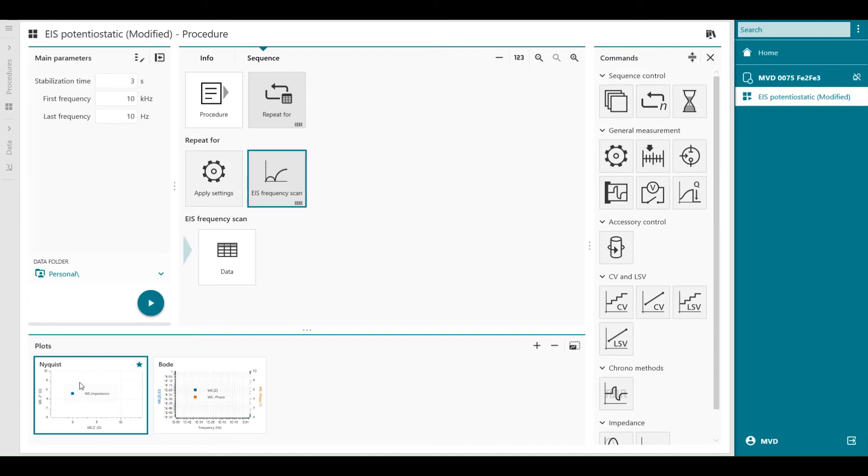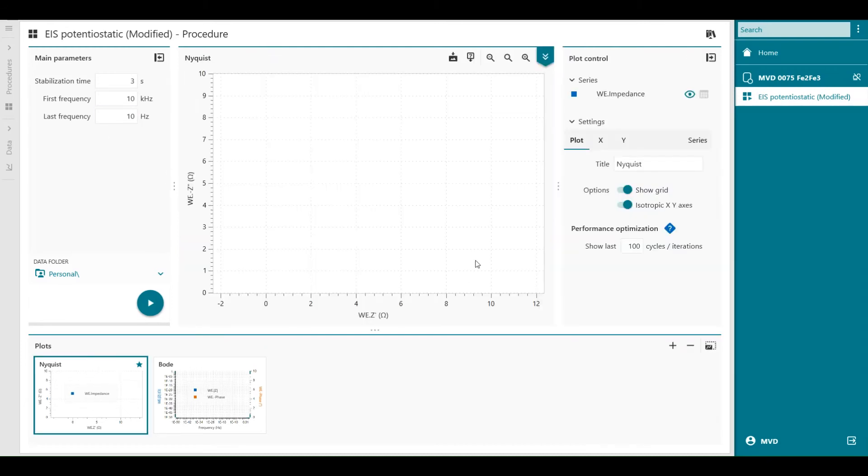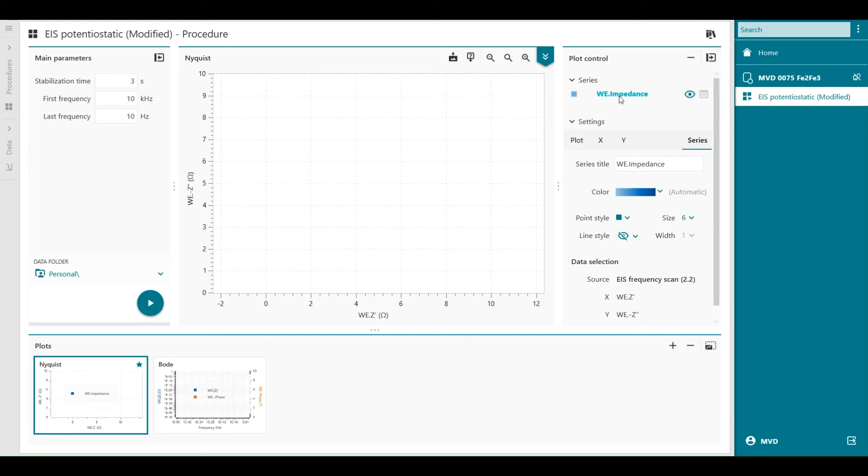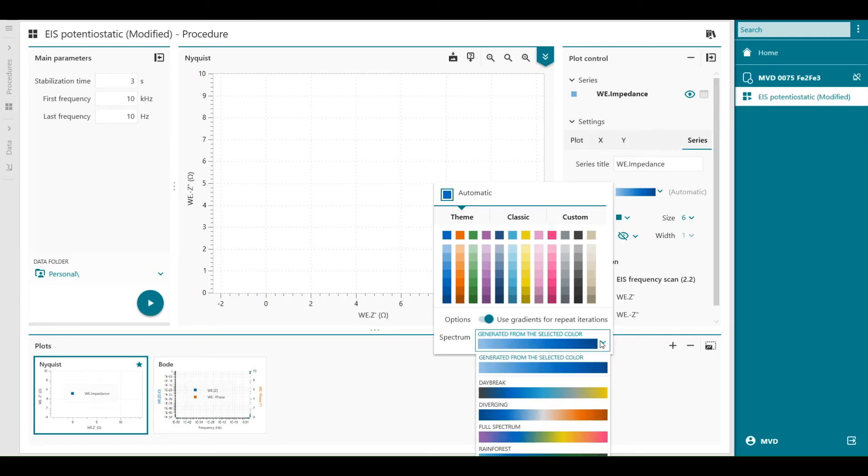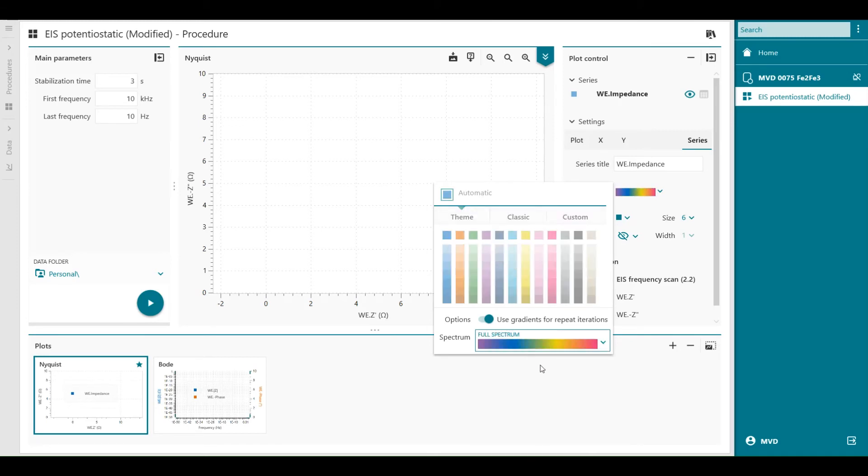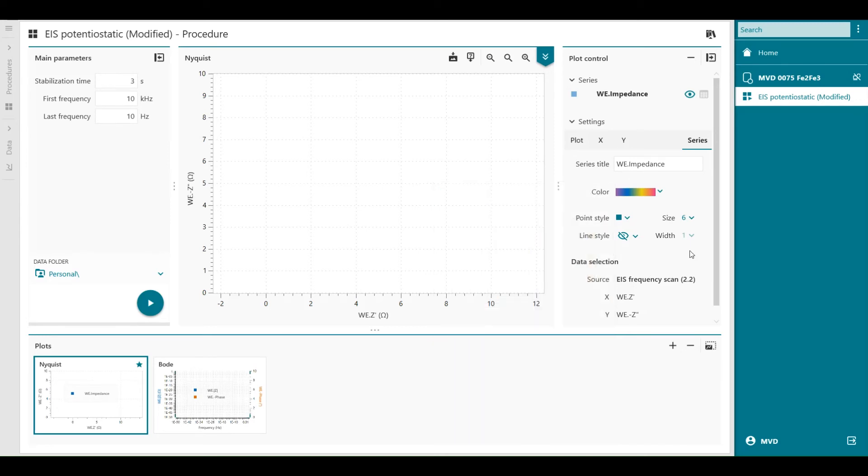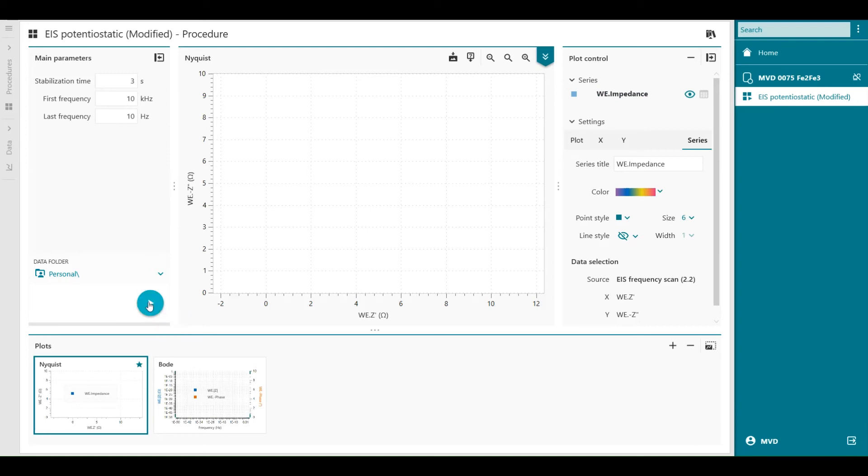And I can modify the plot. Because I want to see after each repeat a different color of my Nyquist plot for example. So I press impedance and I'm going to use the full spectrum of my color gradients. My procedure is set. The values are in the table. The links are created. Colors are changed. And now my procedure is available. So I can press start.